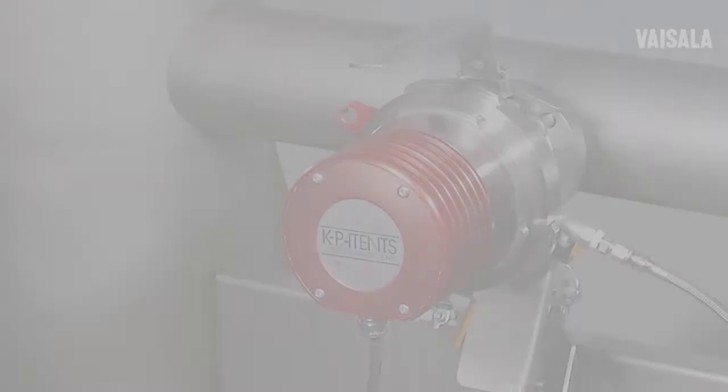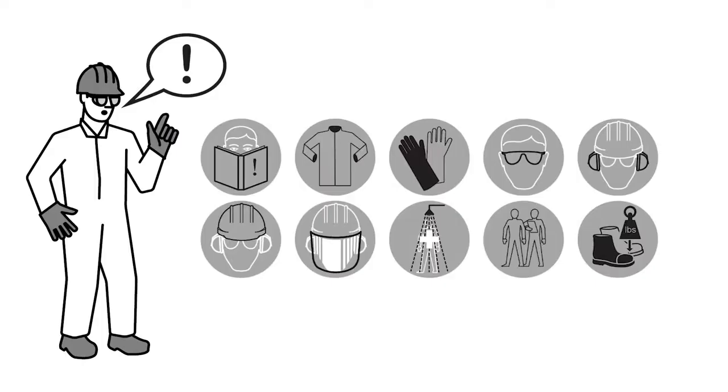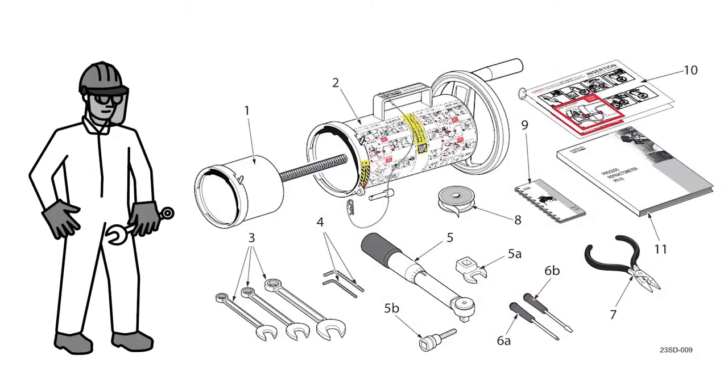This hands-on instructional video shows how to remove K-Patent SafeDrive Process Refractometer PR23SD generation 2.1 sensor from a pressurised process line. Before commissioning work, please make sure you have proper personal protective clothes and correct tools at hand.